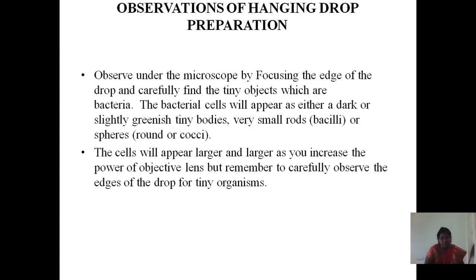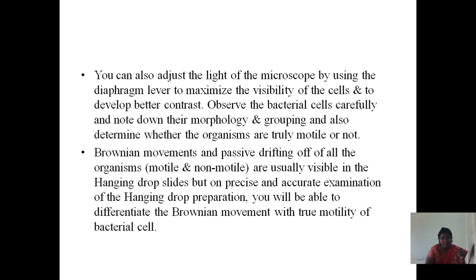Observations of hanging drop preparations: observe under the microscope by focusing the edge of the drop and carefully find the tiny objects which are bacteria. The bacterial cells will appear either as dark or slightly greenish tiny bodies — very small rods called bacilli or round spheres called cocci. The cells will appear larger as you increase the power of the objective lens. You can adjust the light by using the diaphragm lever to maximize the visibility of the cells and develop better contrast. Observe the bacterial cells carefully and note their morphology and grouping, and also determine whether the organisms are truly motile or not.